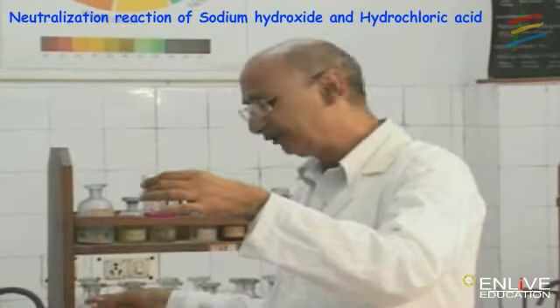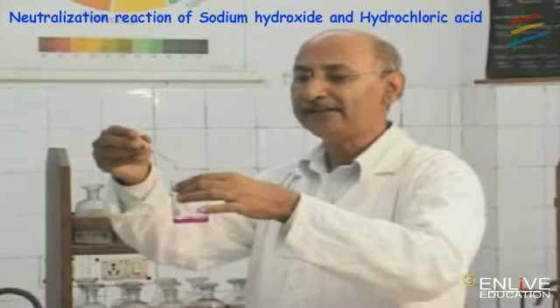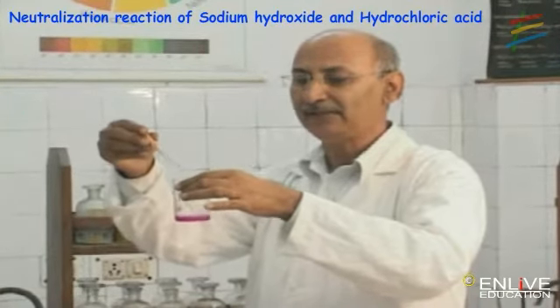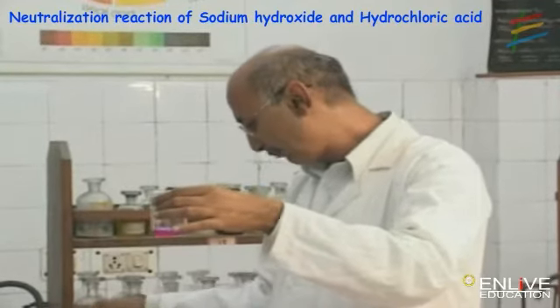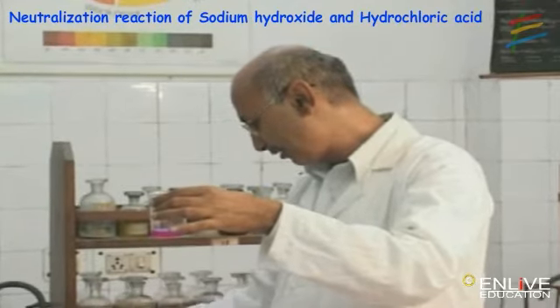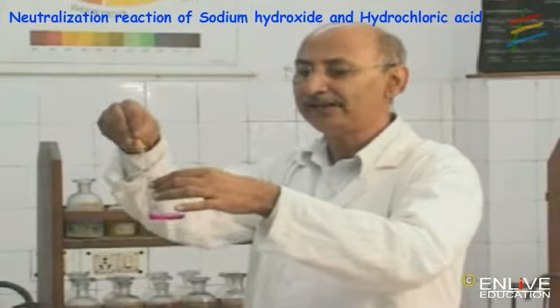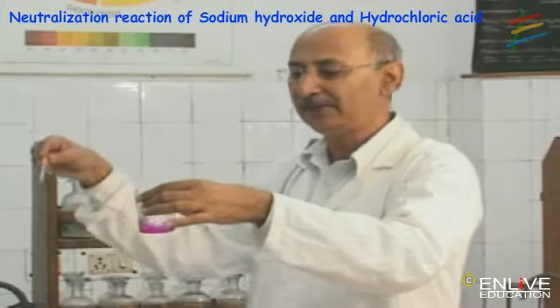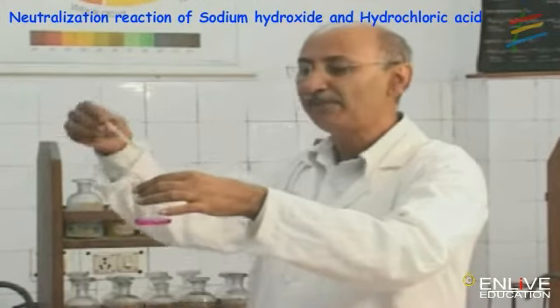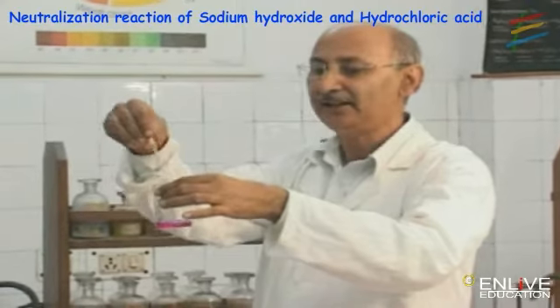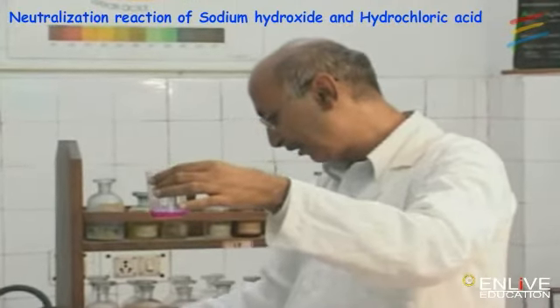It shows that NaOH is there in this beaker. Now I am going to add HCl with the help of the burette. You see the color will become lighter and lighter. We keep on adding hydrochloric acid till it becomes colorless.